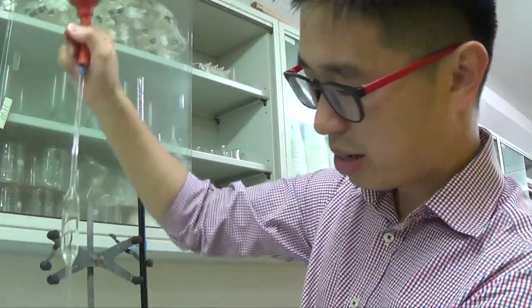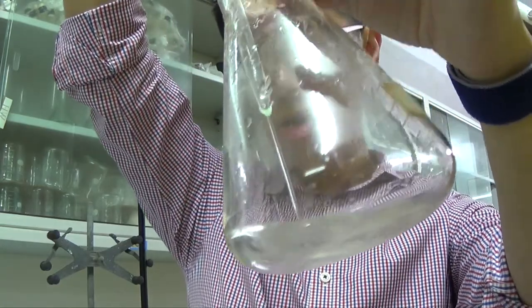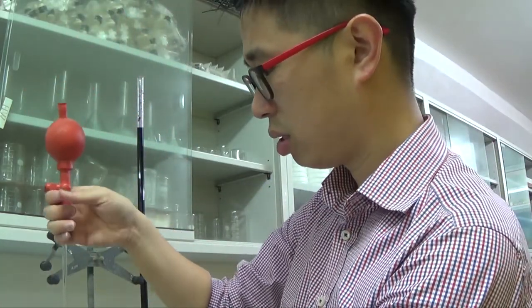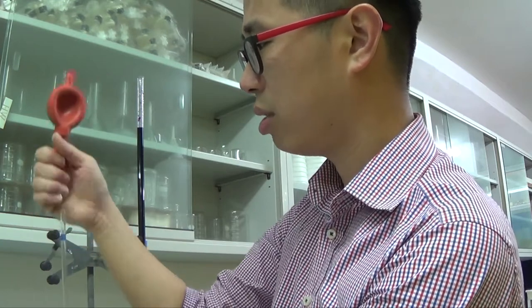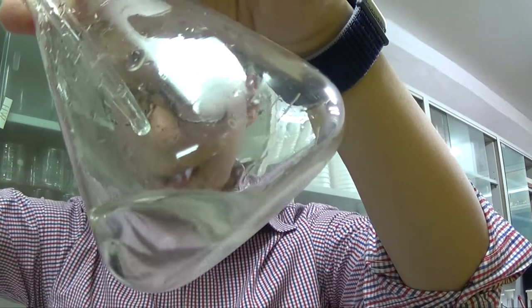So if you press E, it will come down. If you don't press E, it will not come down. If I press E, it will come down because E stands for eject. That will be slow. So what you can do is slowly twist open, but hold the bulb with your other hand. Release, twist it, not pull it, okay? Twist and pull, and then this thing will come down much faster. But there will always be a little bit of solution left at the end of the pipette.